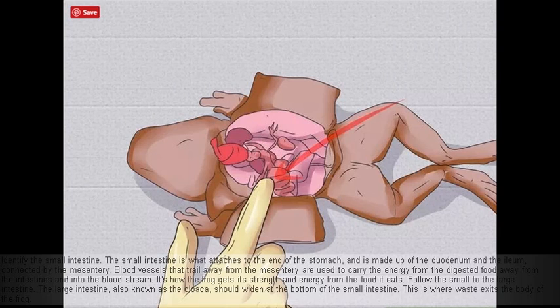Identify the small intestine. The small intestine is what attaches to the end of the stomach, and is made up of the duodenum and the ileum, connected by the mesentery. Blood vessels that trail away from the mesentery are used to carry the energy from the digested food away from the intestines and into the bloodstream. It's how the frog gets its strength and energy from the food it eats.